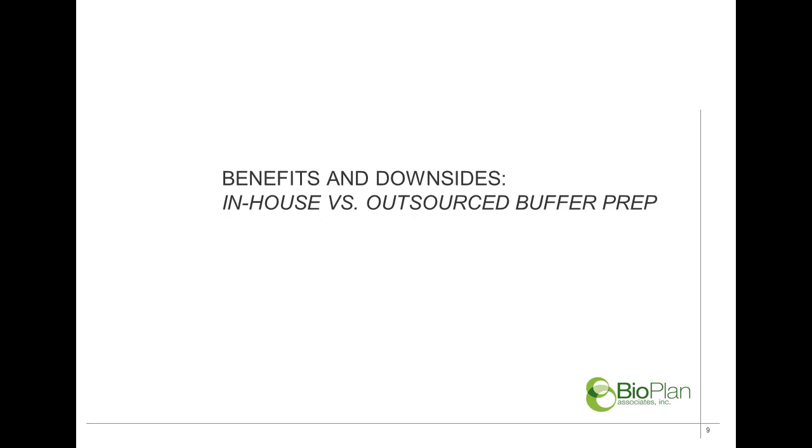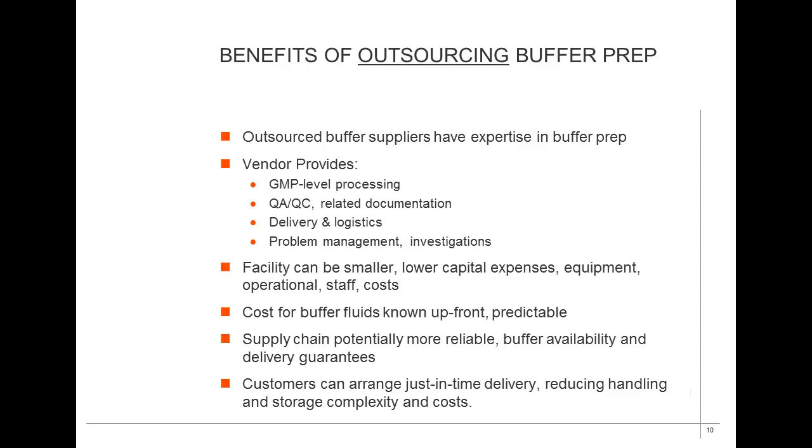We've got some slides here that compare some of the benefits and downsides of the in-house versus outsourced buffer prep. Here we find, as you can well imagine, some of the benefits of outsourcing buffer prep.